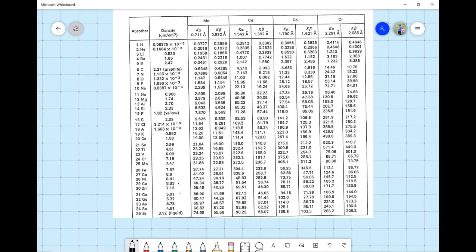So we have our different values we want. Our absorber, in this case, is going to be iron. And we're dealing with cobalt K alpha, if we go back and look. So these are the critical parameters we want to look at here on our table. Sometimes on tests, people get the absorber and the X-ray source mixed up. So just to be courteous, I don't use cobalt as an absorber on test problems because that causes trouble for people. They actually get the concept, but they made a mistake. Maybe they were nervous or whatnot. So we're dealing with iron.